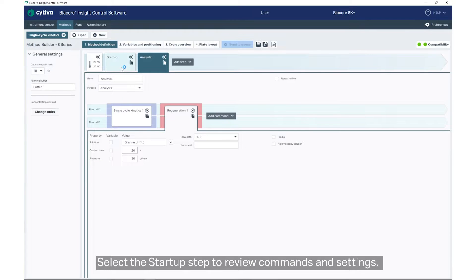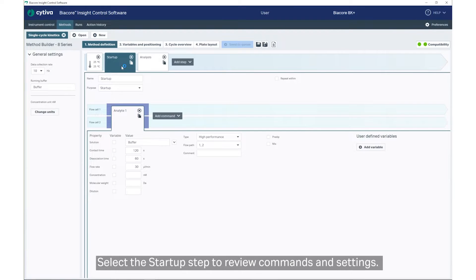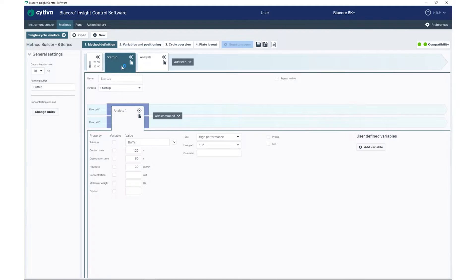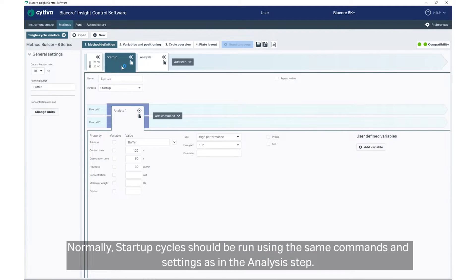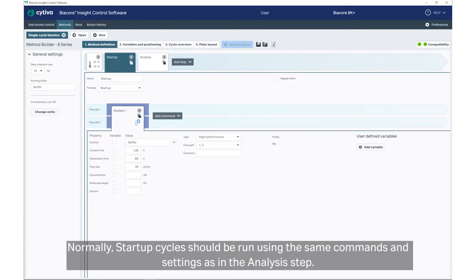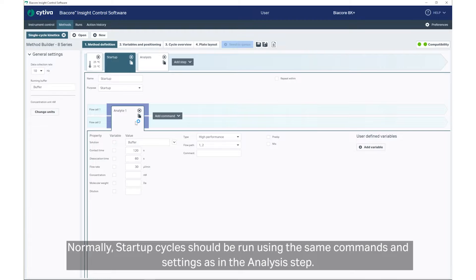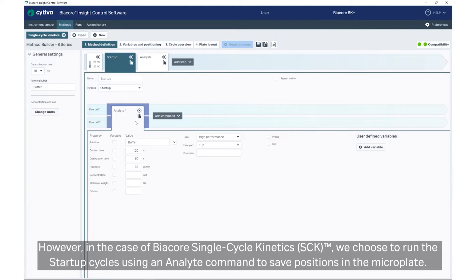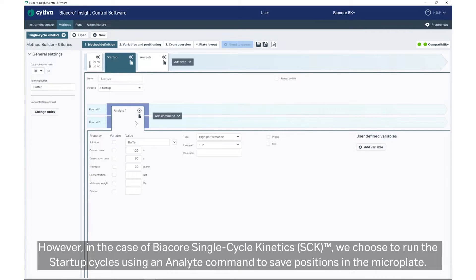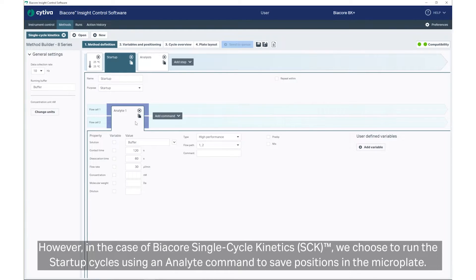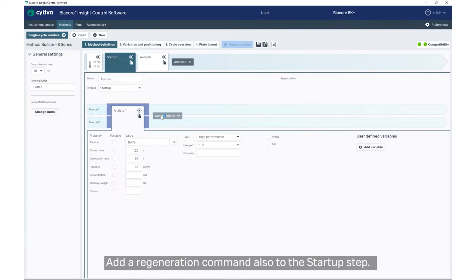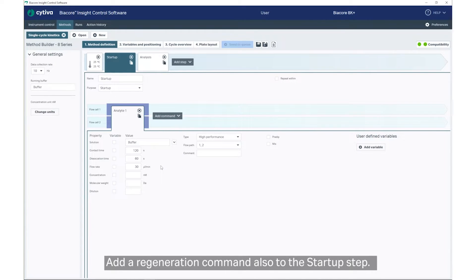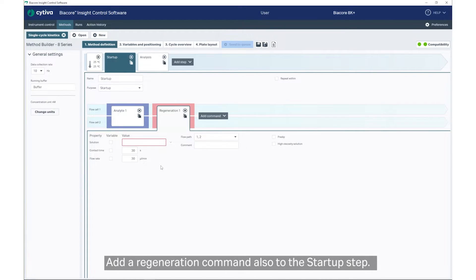Select the Startup step to review commands and settings. Normally, Startup cycles should be run using the same commands and settings as in the Analysis step. However, in the case of Single Cycle Kinetics, we choose to run the Startup cycles using an Analyte command to save positions in the microplate. Add a Regeneration command also to the Startup step.